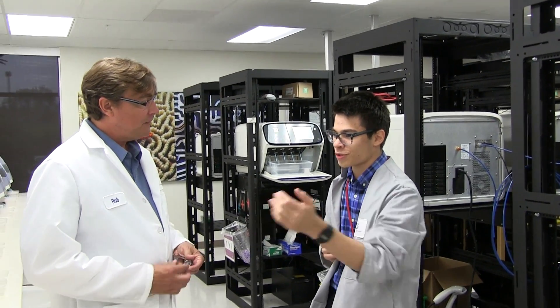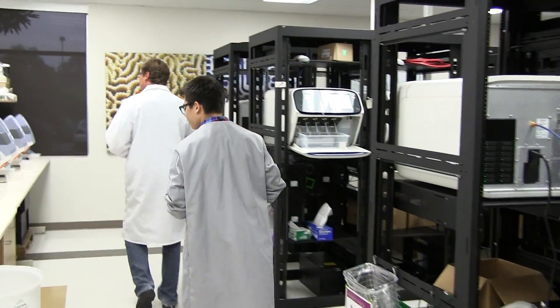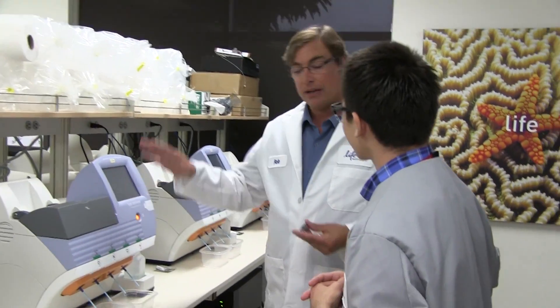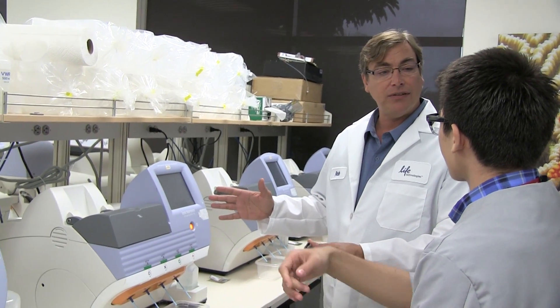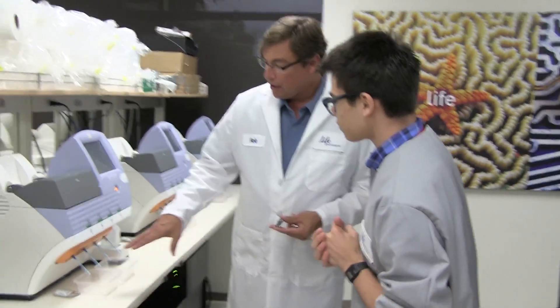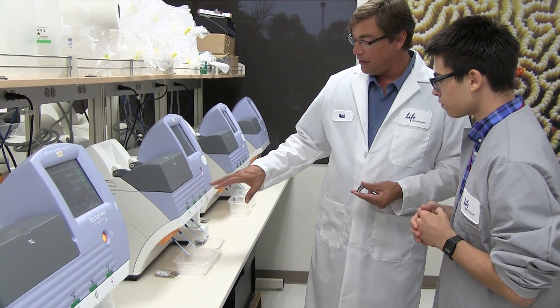Let's take a look at the Personal Genome Machine. This is the Personal Genome Machine — really one of the first sequencing instruments that can sit on a bench like this, allowing every lab to have access to a sequencer. It's very simple: you load the four nucleotides used for sequencing — GTP, CTP, ATP, and TTP.